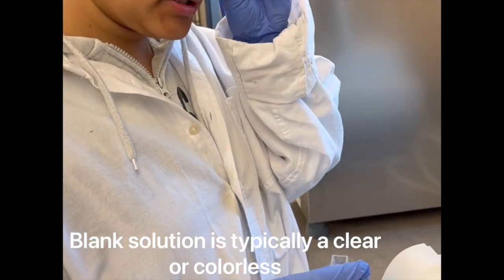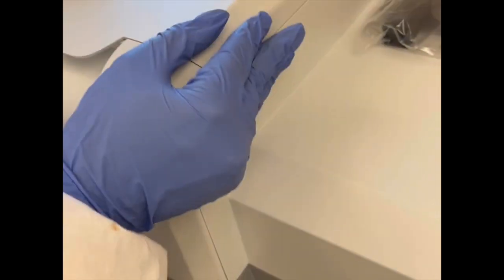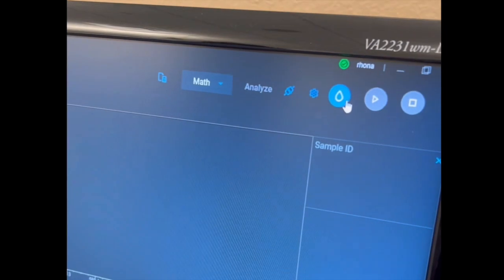So I'm first adding the blank solution into the UV-Vis spectrophotometer. We add that in there, close this, and we can run the program.